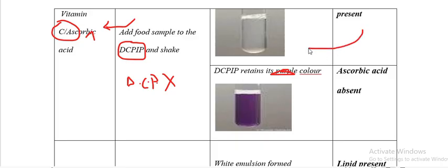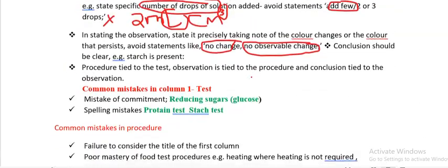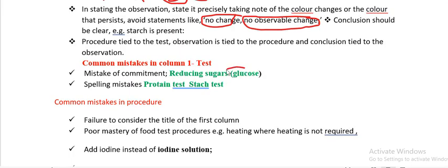The conclusion is tied to the observation — if the observation is wrong, the conclusion will also be wrong. Common mistakes in column 1 (food substance column): writing 'reducing sugars' with 'glucose' in brackets — that is wrong. Spelling mistakes for words like 'protein' and 'starch' should be avoided.